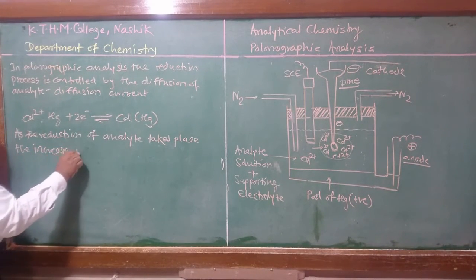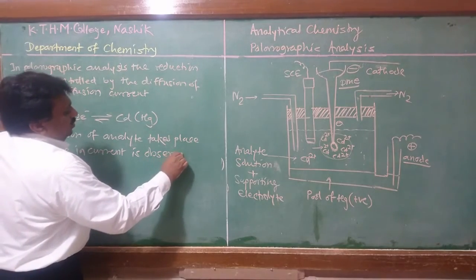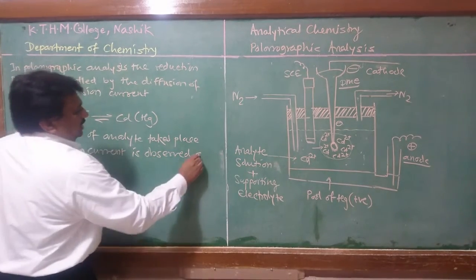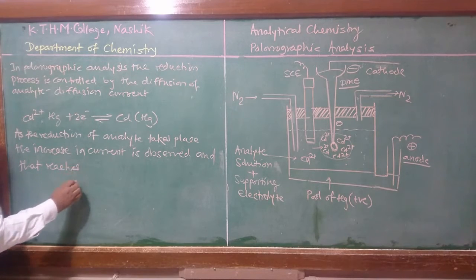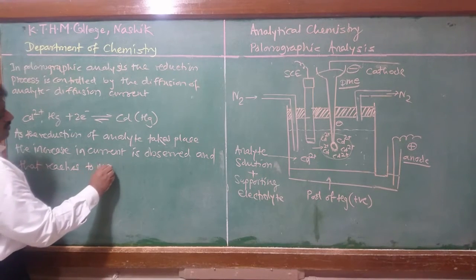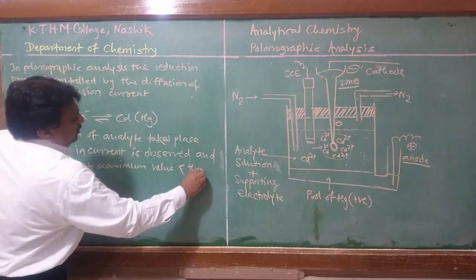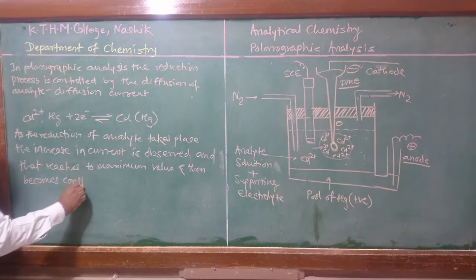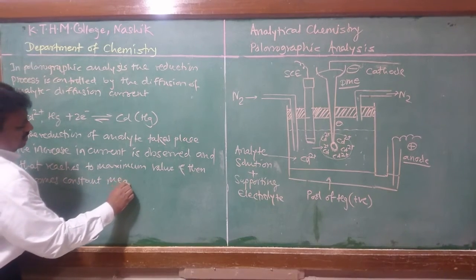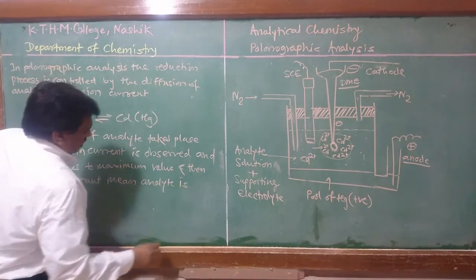The increase in current is observed, and that reaches to maximum value, and then becomes constant, means analyte is completely reduced.